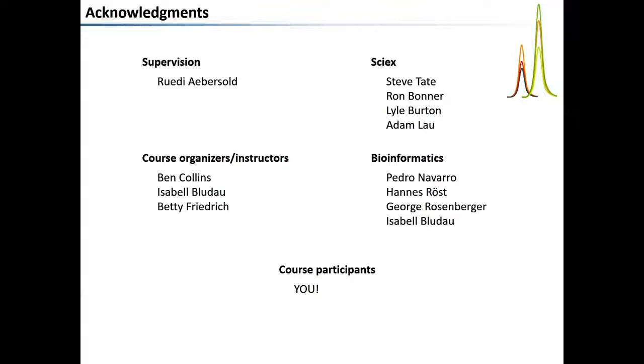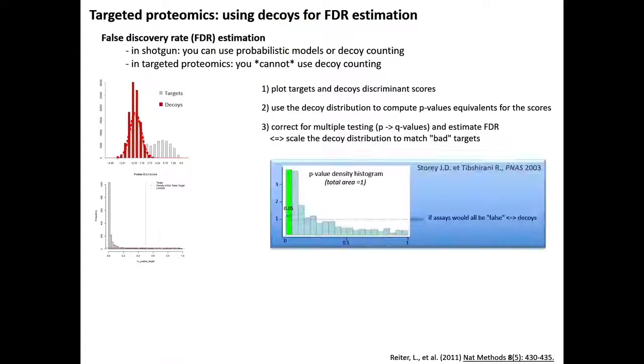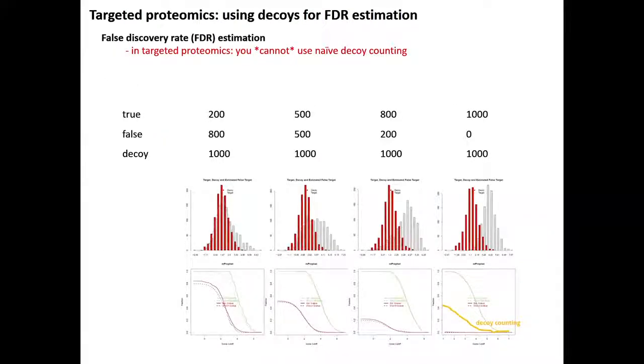So you said that the decoys provide an estimation of the sample noise, but when you use a larger spectral reference library, you then have a larger decoy library, which ultimately means that you have a harsher penalty when it comes to the FDR. So does that mean that there's a slightly different null hypothesis that we're testing, because it does then affect the... So you can very well imagine.